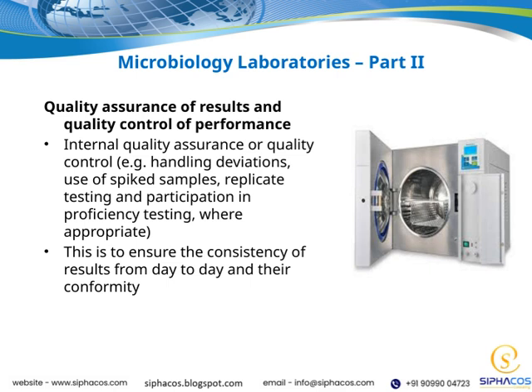The main goal here is to ensure that our results are consistent from day to day and that they conform to the required standards. By doing this, we uphold the integrity of our microbiology laboratories and ensure that our findings are dependable, which ultimately supports better decision-making and patient care.